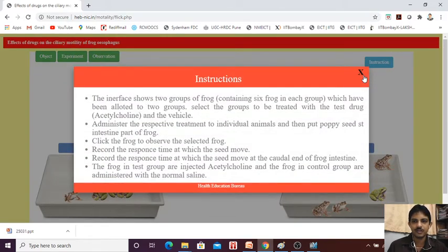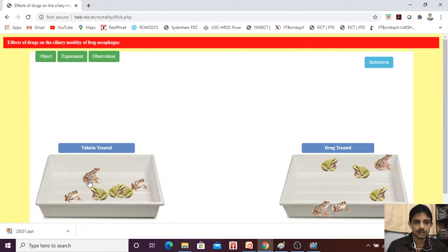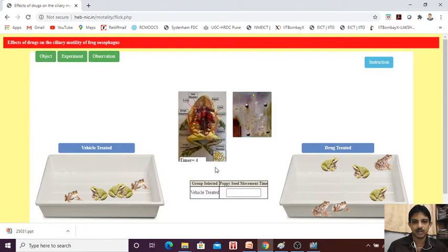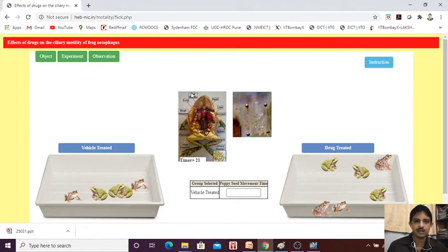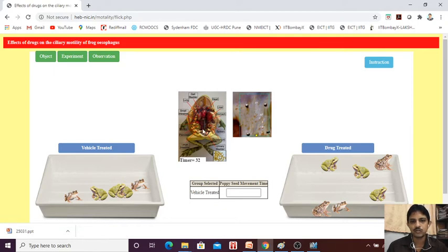Just I will show you — this is the vehicle treated and drug treated. Now see, this is the frog. In the frog, we have to cut open this particular area. No need to cut all those things — we are just separating out the cilia.